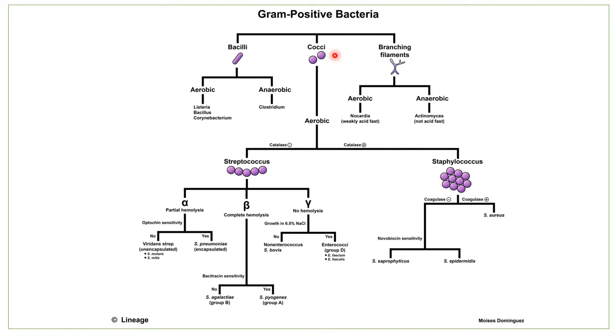Depending on your gram staining result, which is gram positive, and the shape of your bacteria, you can easily follow this chart and identify. But I am again marking my words that this is just for first year students, who are new to Bergey's manual, and it is difficult for them to handle the book and follow these steps to identify.